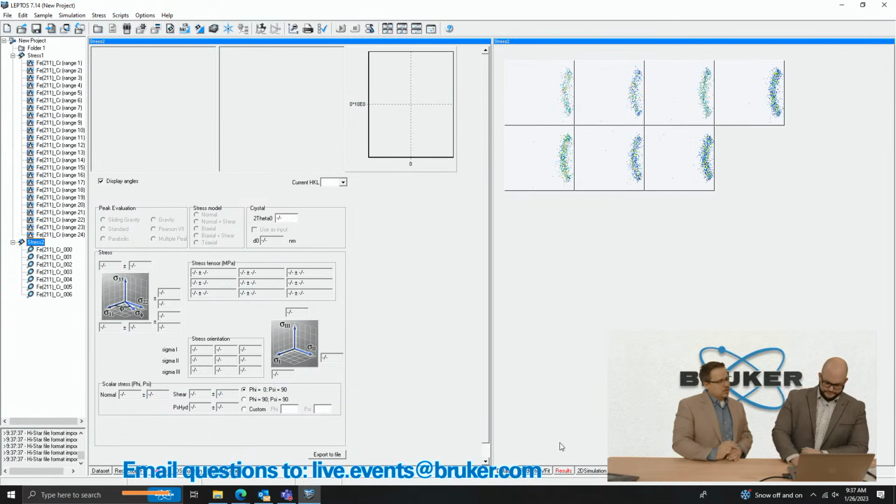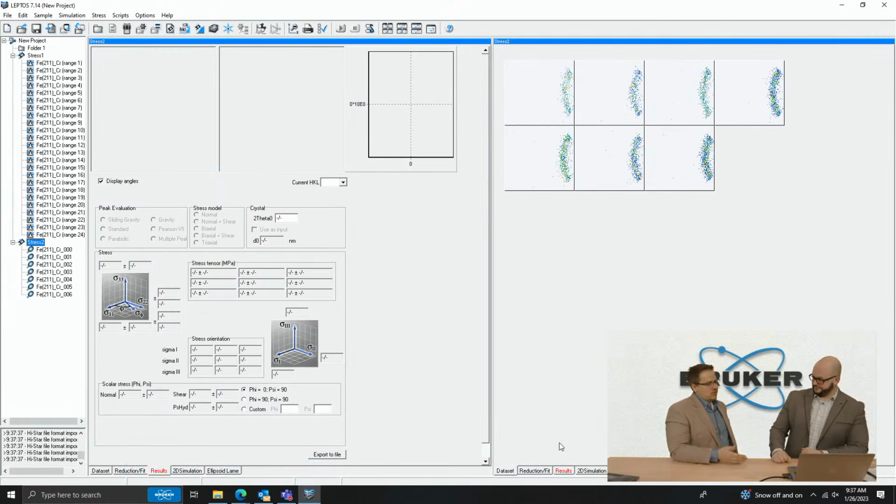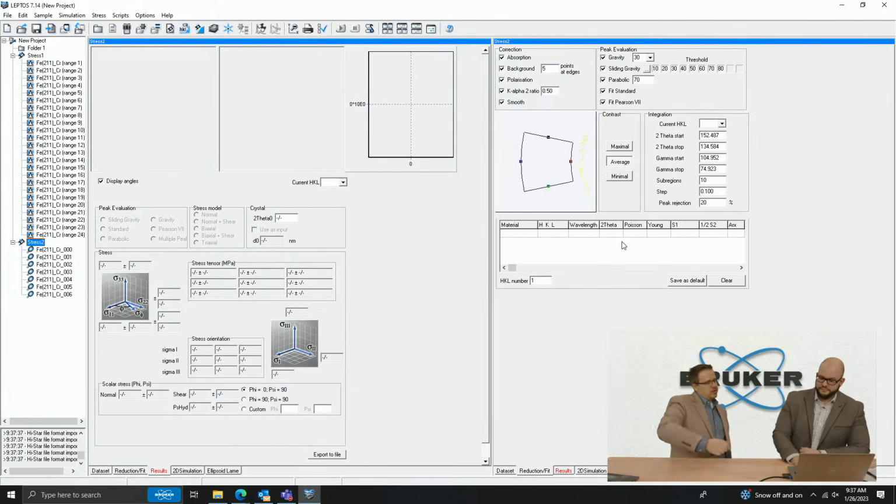It looks like you just imported the data. Very easy. It came in, and you can see we have 7 frames. And we see the Debye ring going on there. I'm going to change the contrast a little bit so we can see it better. Then you can just use this cursor to fit and get some background in there.